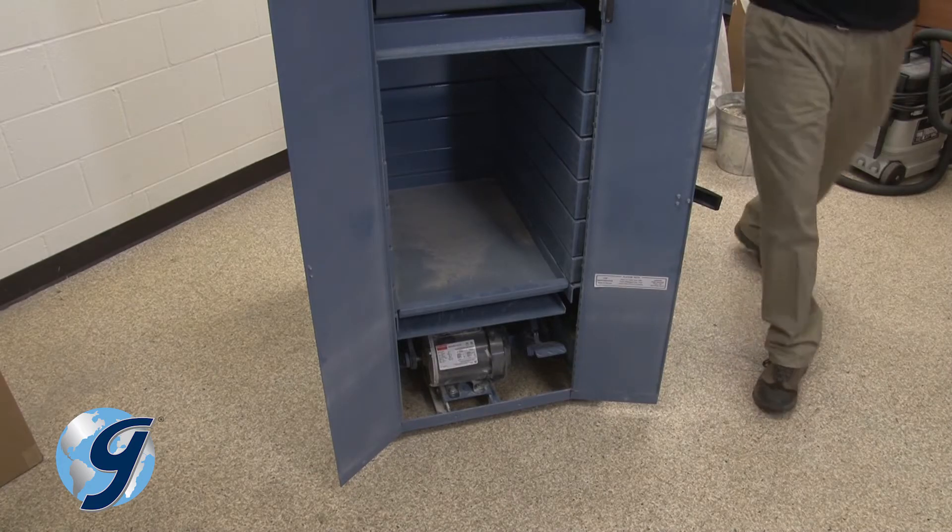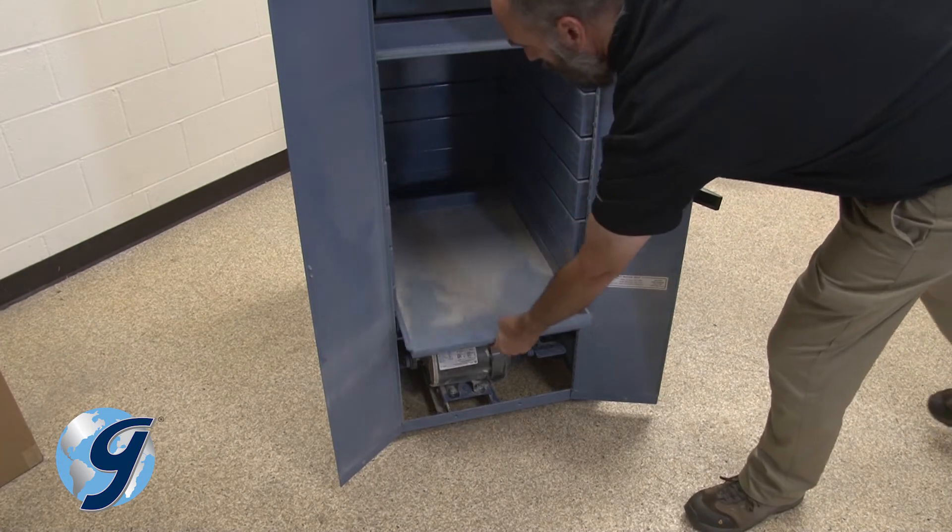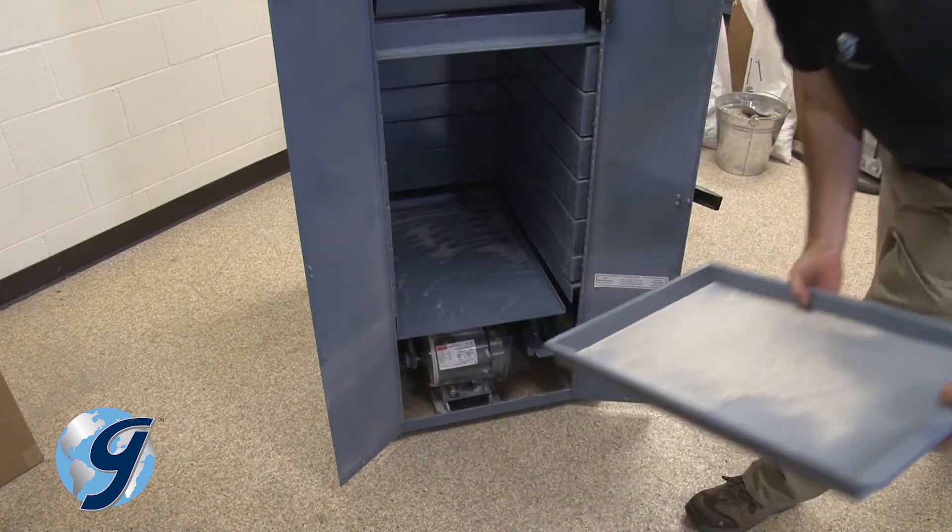Next, open the doors, remove any screen trays or pans, and set them aside.